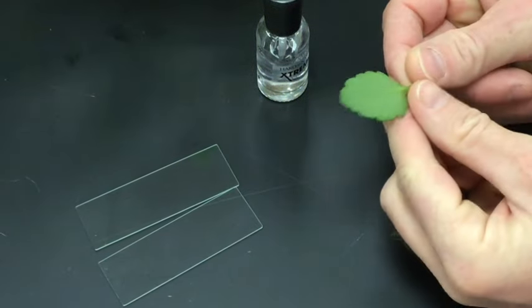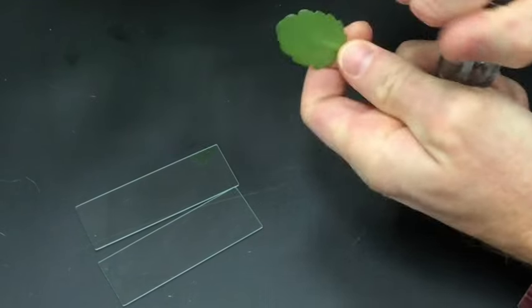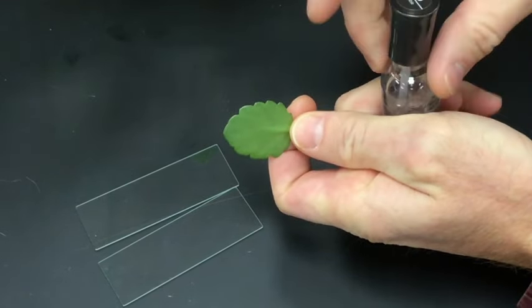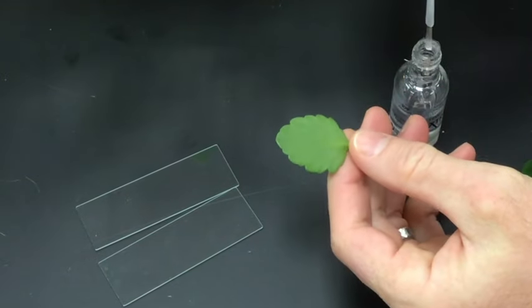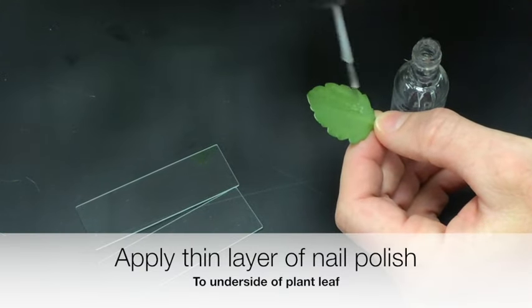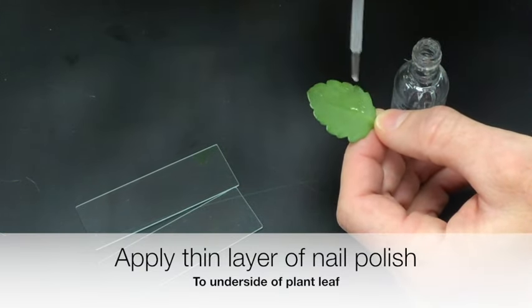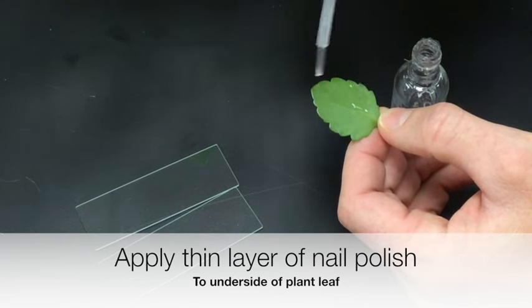Okay, so I'll take the succulent plant first, grab the nail polish. What I want to do is paint a really thin layer, avoiding the veins. There aren't a lot of veins on the succulent, so I'm just going to paint it along one side here, making sure that it's not a very thick layer.